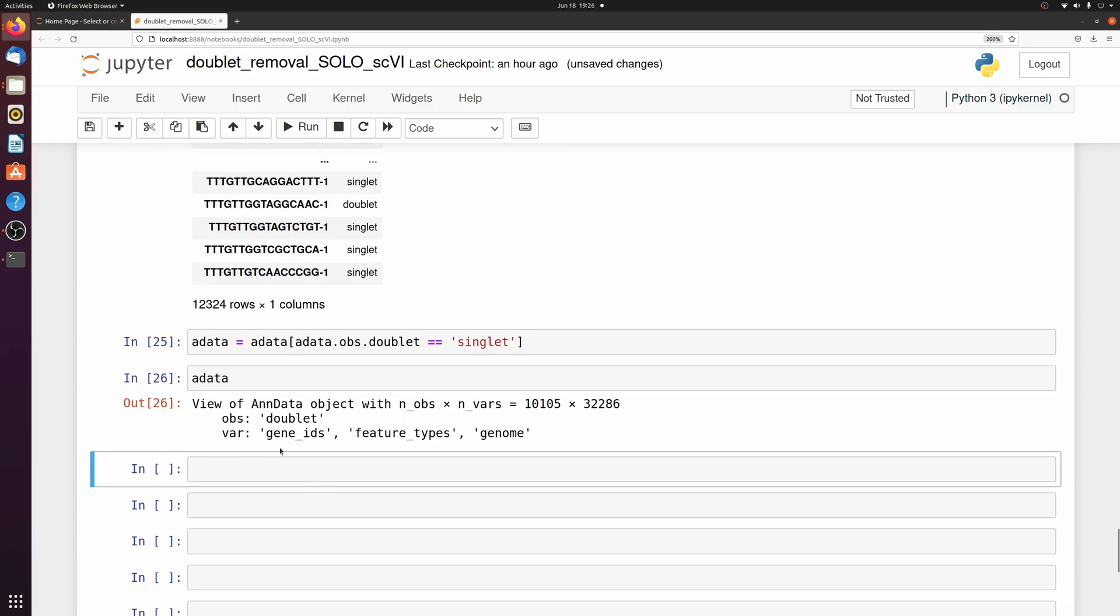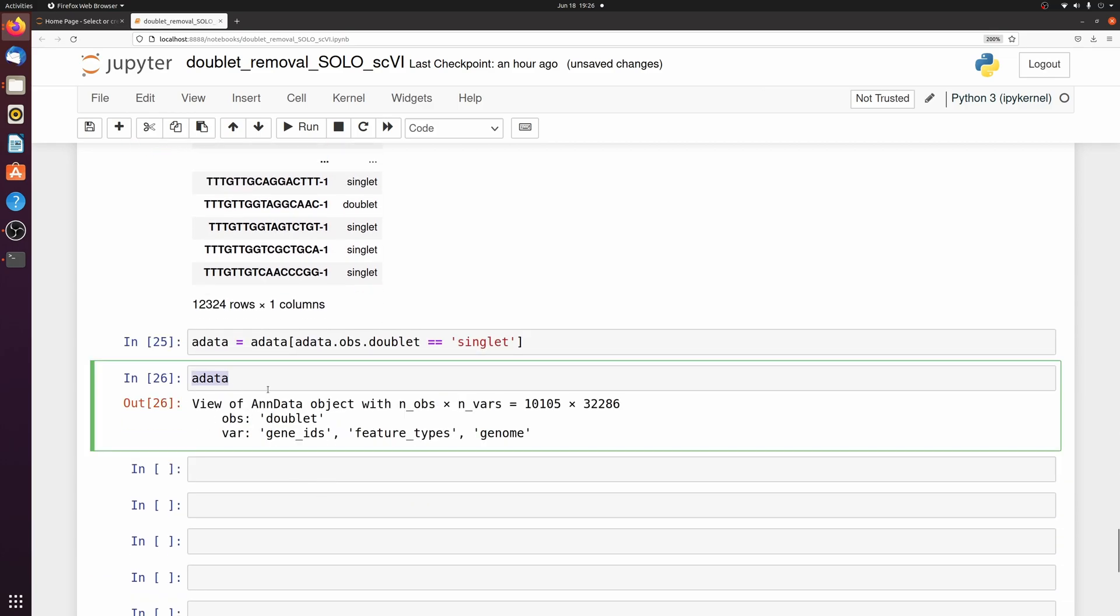And we only want to keep the singlets. And now we have our filtered adata object which you can do whatever you want with now. So it's really only a handful of lines of code that you can just put in a little function when you load in an individual adata object.